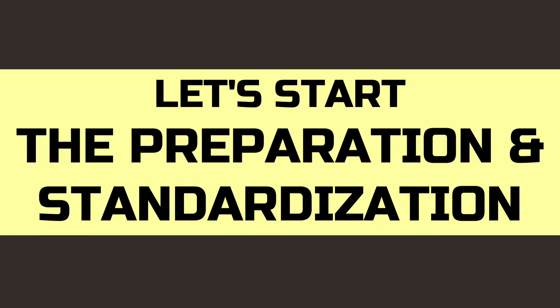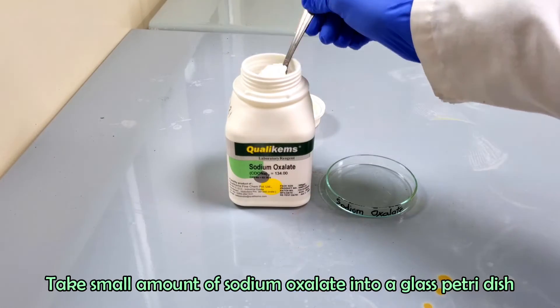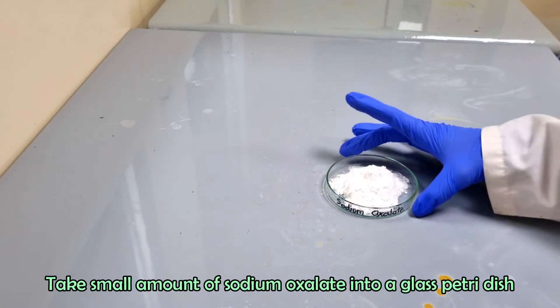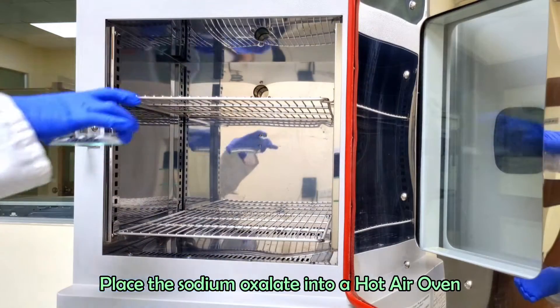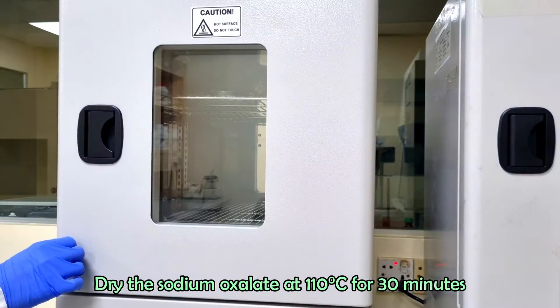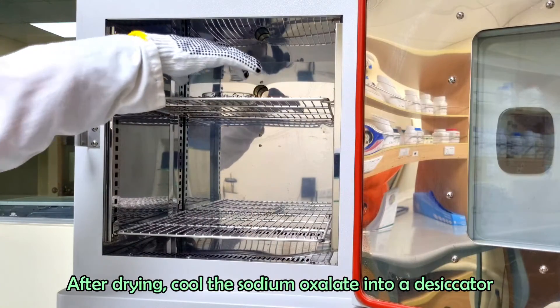We will prepare 0.1 normal sodium oxalate solution. Take a small amount of sodium oxalate into a glass petri dish. Dry the sodium oxalate in a hot air oven at 110 degrees Celsius for 30 minutes. After drying, cool the sodium oxalate in a desiccator.